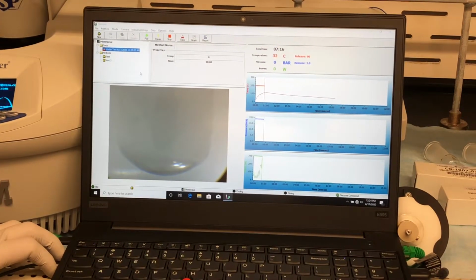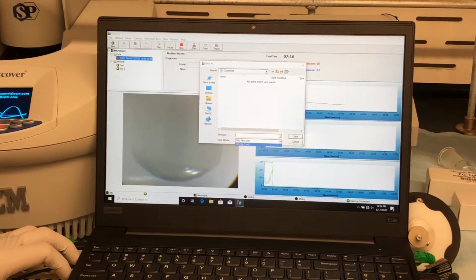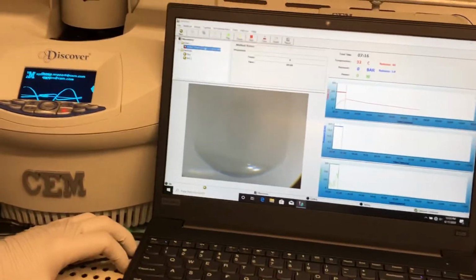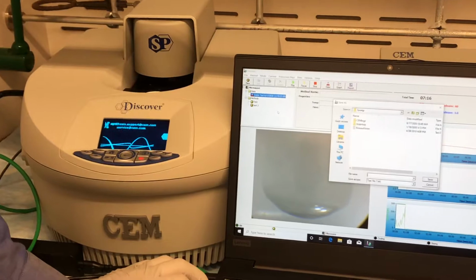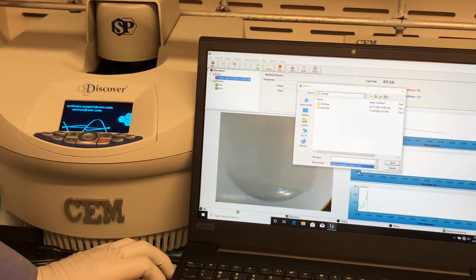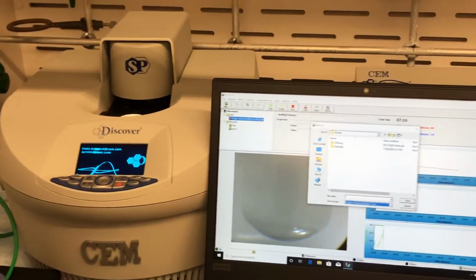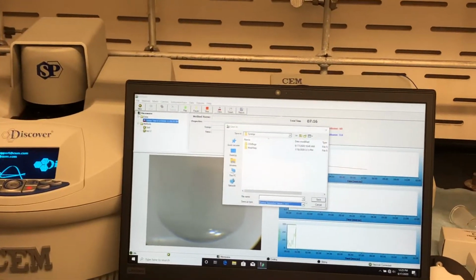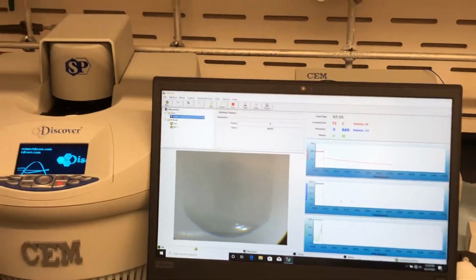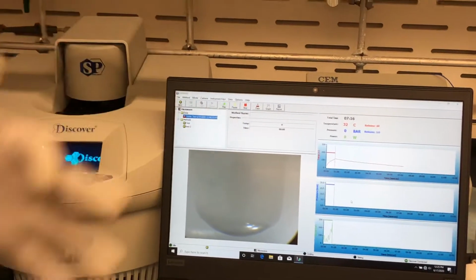Export data, okay. I believe you can do it as an XML. I think you can do CSV if you do save data. Let's see. Oops, sorry. Right click, save data file. You can do it as straight text or comma separated. I usually recommend comma separated, then do it in Excel. CSV, comma separated. Then just name it and pick where you want to save it. There should be 3 or 4 columns, and on the side it'll be your intervals of when they were taken. Then you can run your graphs and data from there.